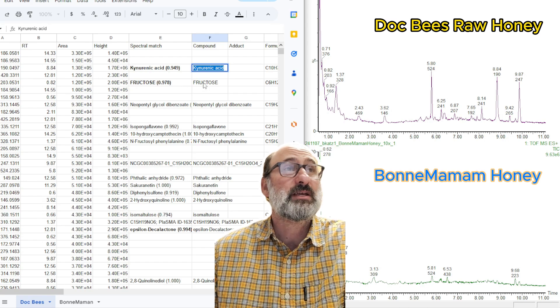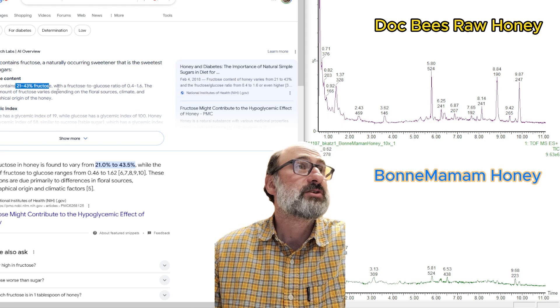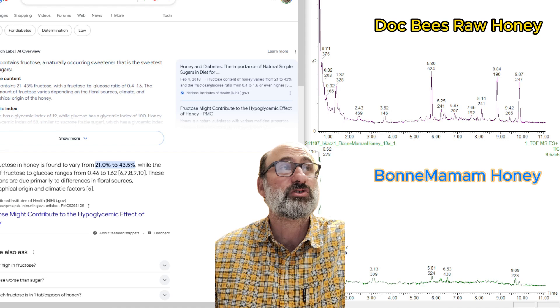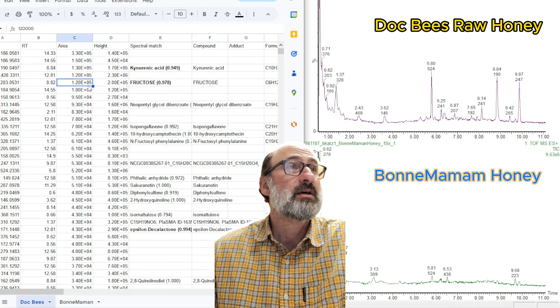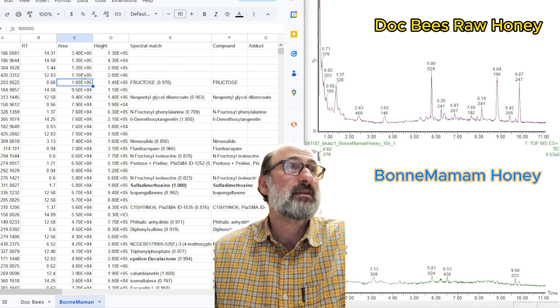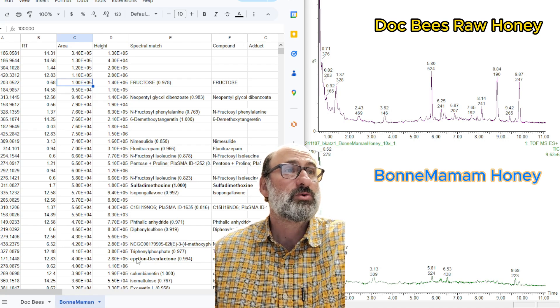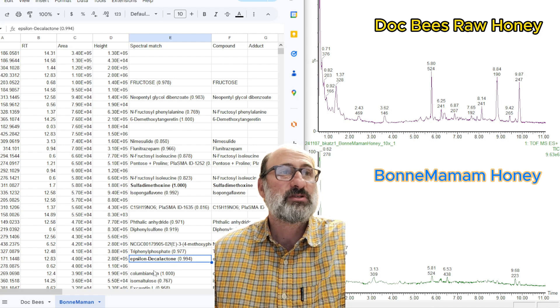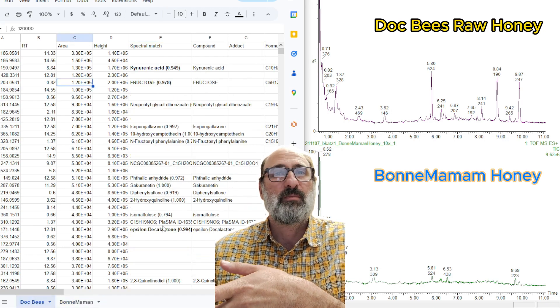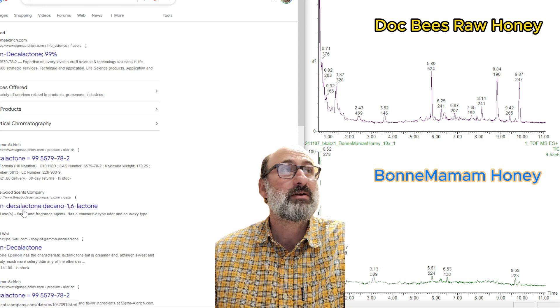The next thing we're seeing in both honeys, really clearly, is fructose. Fructose is roughly 21 to 43 percent of the sugar content in honey, along with a little glucose and other sugars. The fructose amount varies based on floral source, climate, and so on. We're seeing 1e5 fructose in the Dockbeez and 1e5 in the Bonne Maman, so these honeys have pretty similar fructose composition. The next cool thing is that in both of them we see Epsilon-Decalactone. These lactones have flavor — a lot of people like lactone flavors, which are typically creamy, waxy, almost candy-like flavors.